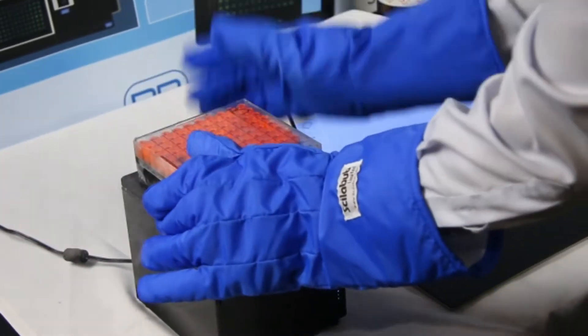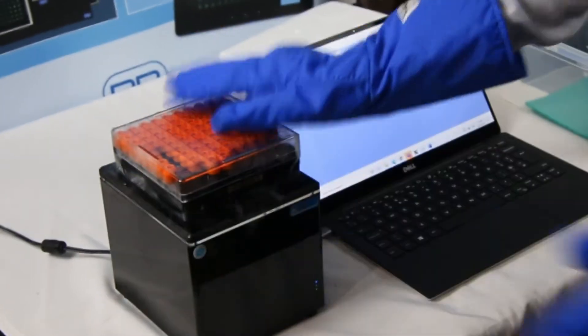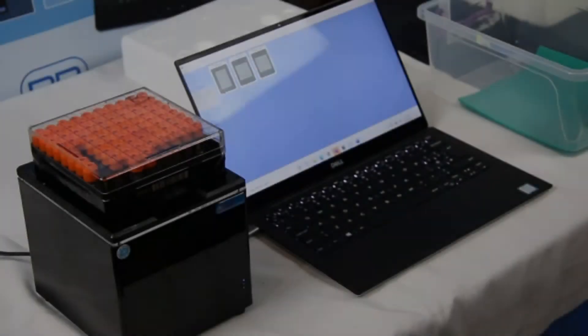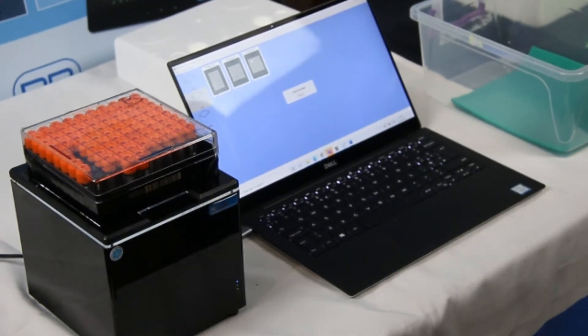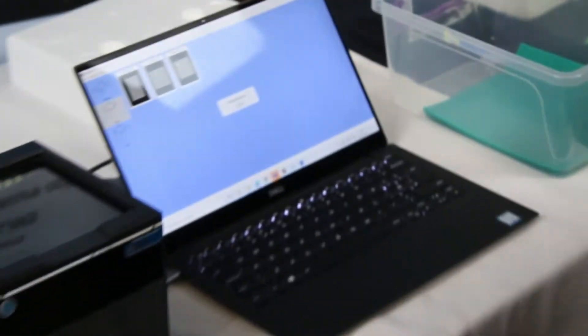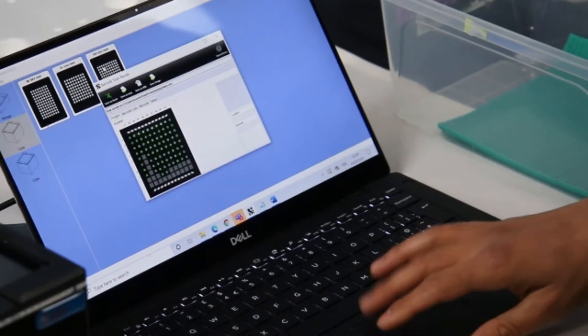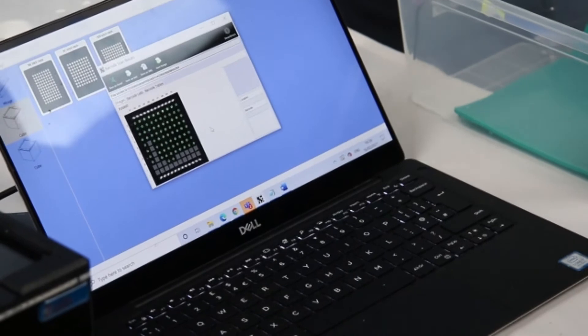Next, we can place it on the scanner to decode the rack. Select the required template to run the scan. As soon as the light goes out, take the rack off and leave it on the side. The complete scan and decode is shown on screen there.